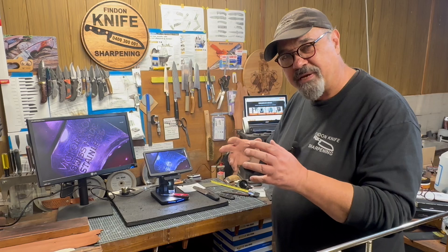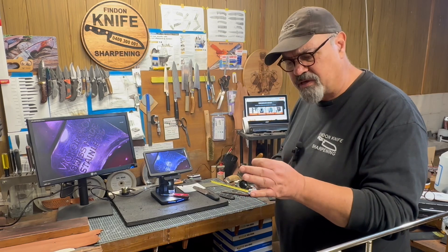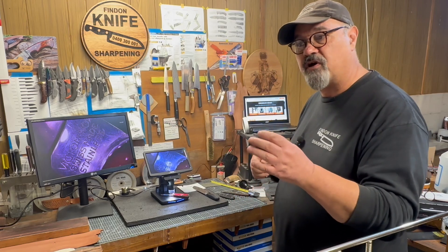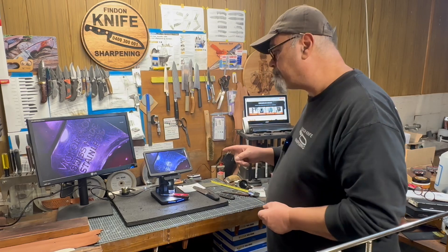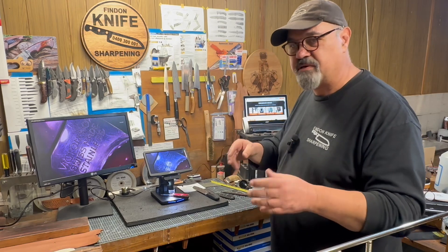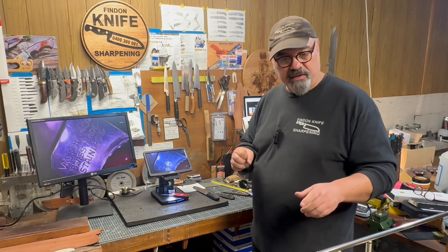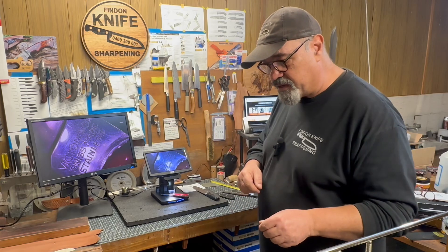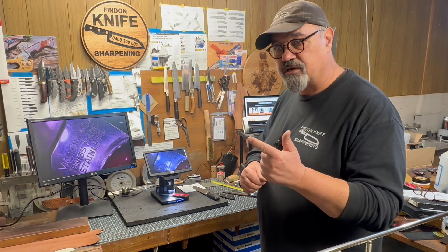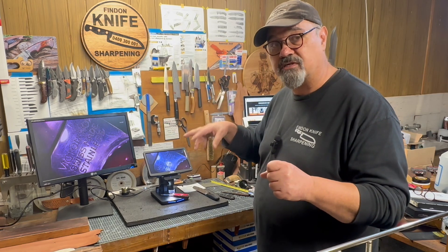I was having some trouble getting the knife edge to reflect properly. Paul from Alexandria Knife Sharpening has a filter of some sort that stops the reflection coming straight back at the camera - I might look into that. I'll put a link to his video down below. There are also affiliate links to buy this - they give me a few bucks. There's a US price, a Euro price, and an Australian price.